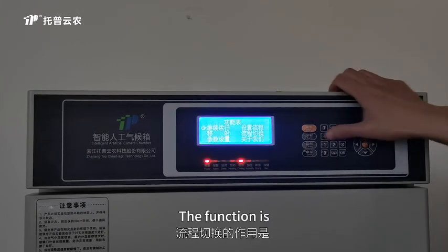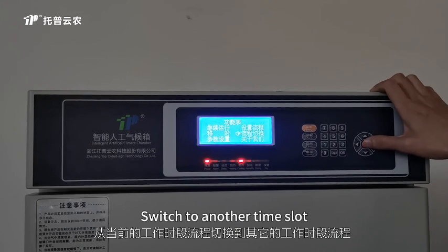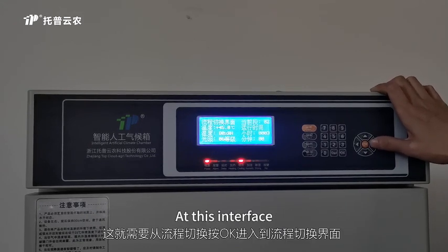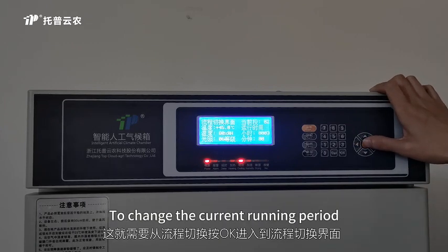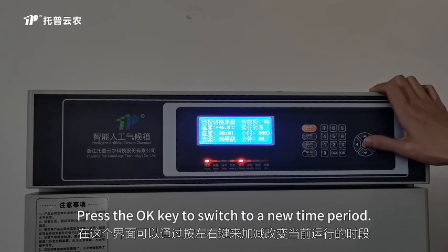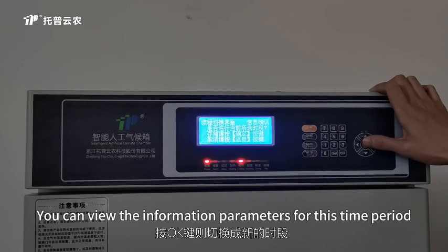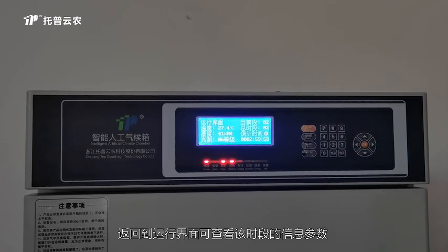6. Process switching. The function is to switch from the current working hours to another time slot. On the home page, press the OK button to enter. At this interface, you can add or subtract through the left and right keys to change the current running period, switching to the time period required. Press the OK key to switch to the new time period. Return to the runtime interface. You can view the information parameters for this time period.